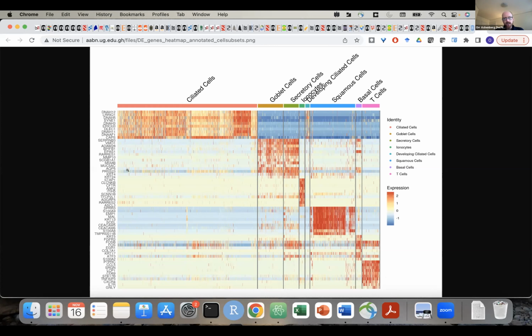So it's not, strictly speaking, a pipeline. Single cell RNA sequencing analysis has come a long way, and there are far fewer choices you have to make than you had to make like 5 years ago. There are things you can just run and they'll probably be interpretable, but there's still this element of interpretation and cycling back.